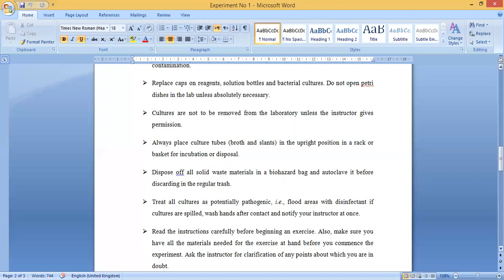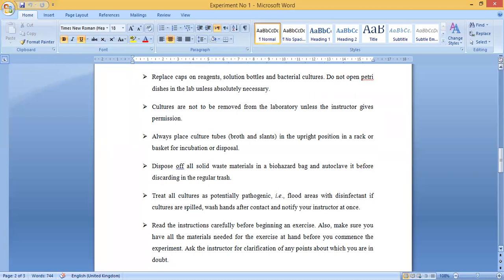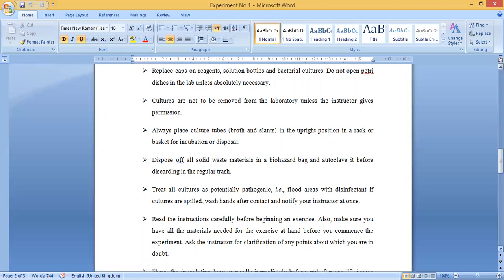Read the instructions carefully before beginning any exercise. Whenever you are going to do an experiment, you must follow the instructions. Also make sure you have all materials needed for the exercise at hand before you commence the experiment. Ask the instructor for clarification of any point about which you are in doubt. All your experimental materials must be placed aside and the procedure known before starting.